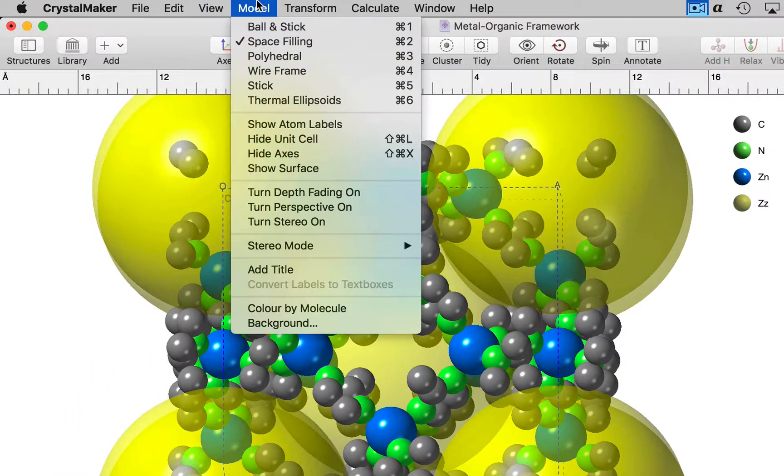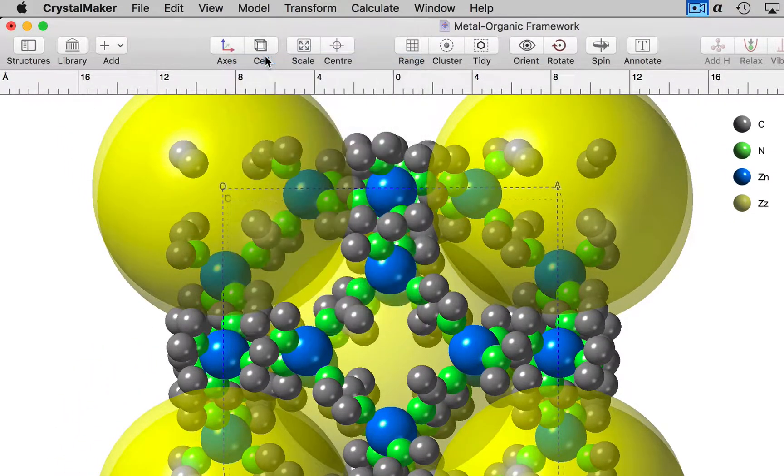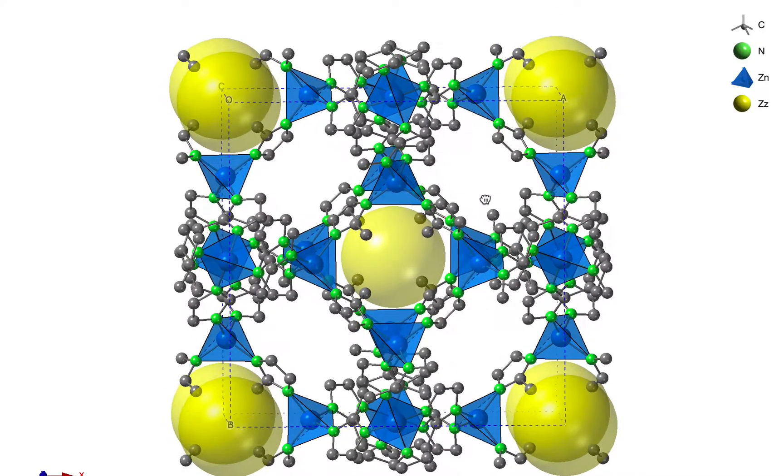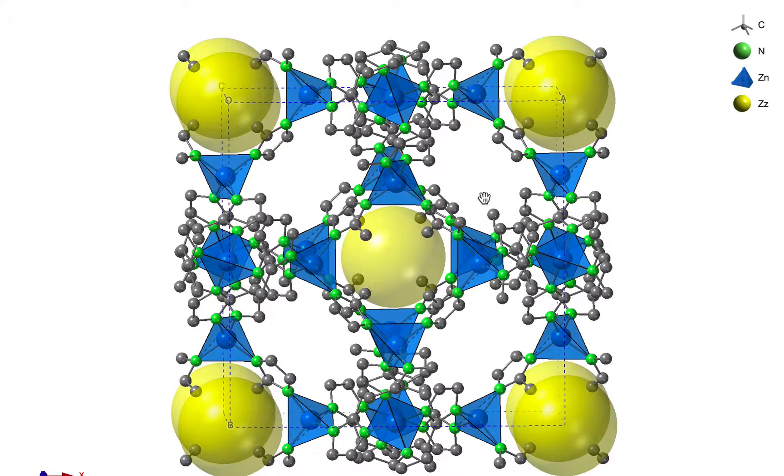Let's switch to a polyhedral model. Here we've got our dummy sites in the middle, but the sites are plotted as if they were ball-and-stick spheres. We need to adjust the size of these dummy spheres to make them appear at their correct space-filling size.